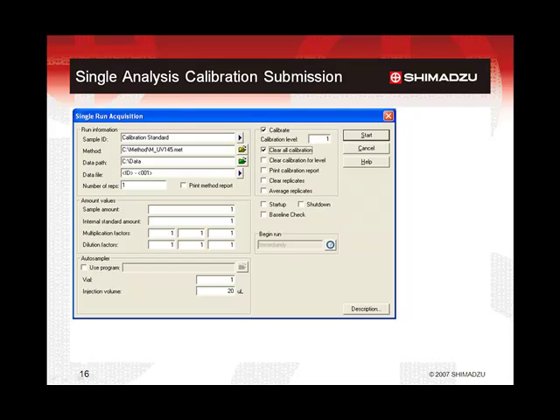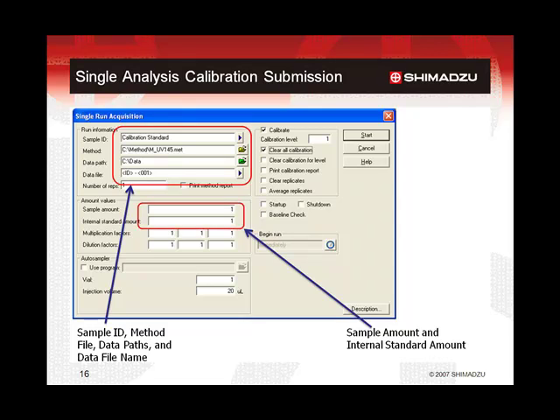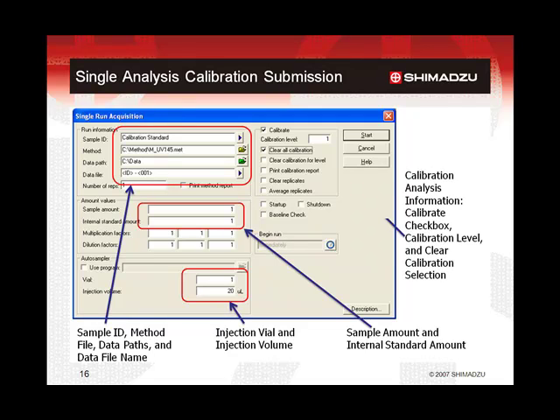Here is an example of setting up the single analysis mode for calibration. This uses the sample entry form for the single run acquisition. The sample ID, method file name, data path, and the intended data file name must be entered. The sample amount and internal standard amount are usually set to 1 for calibration analysis, but may be changed for unknowns depending on the analysis conditions. The injection vial position number must correspond to the correct standard sample vial. The injection volume must match the needs of the analysis and the capability of the instrumentation. To have the analysis automatically provide results to the calibration process, the calibrate checkbox must be checked and the appropriate level number of the standard vial about to be analyzed must be entered.